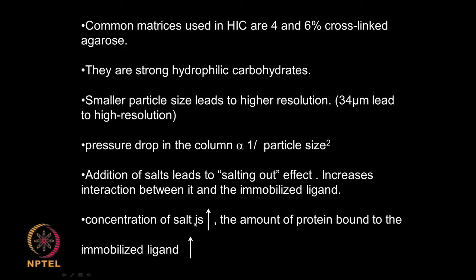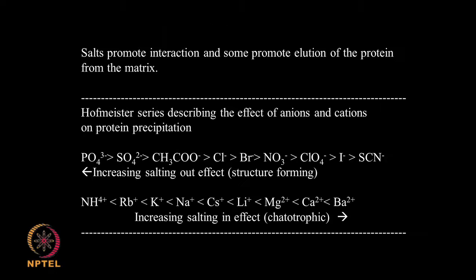So, if the concentration of salt is increased, the amount of protein bound to the immobilized ligand also increases, that is the salting out. Later, if I want to recover whatever has been bound, I will use a low salt, so that the bound protein will come back into the continuous phase. So, salts promote interaction and some promote elution of the protein. Here the salting out effect which we talked about in the early class will come in, the Hofmeister series.